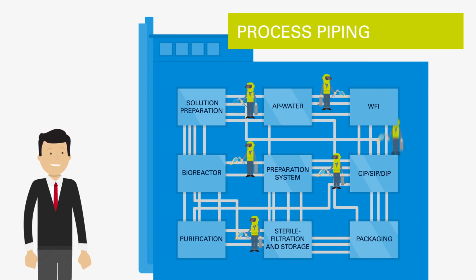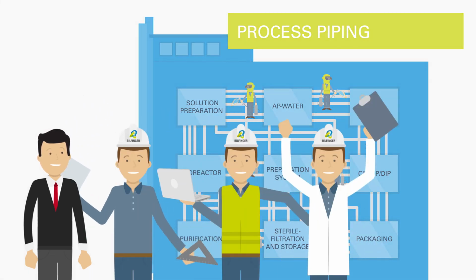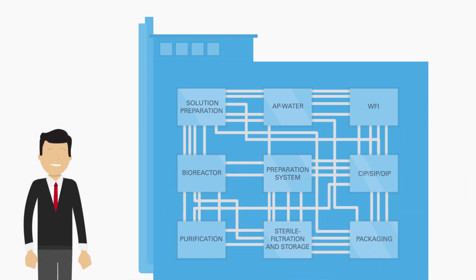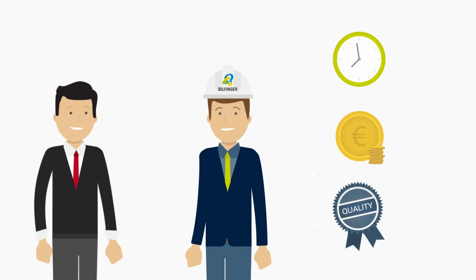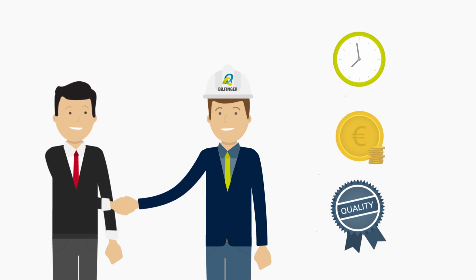So you see, Bilfinger offers everything from one source, from engineering over commissioning to qualification and subsequent maintenance. The Bilfinger project managers accompany you during the entire project and ensure that even complex facilities are completed on schedule, in your budget, and with the best possible quality. If you're looking for a reliable partner for your production, now you know who to contact.